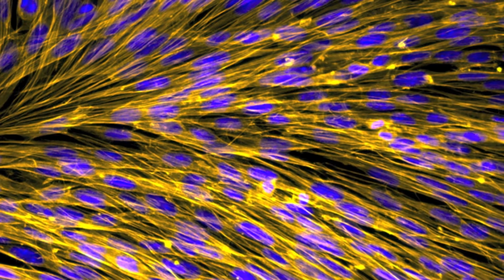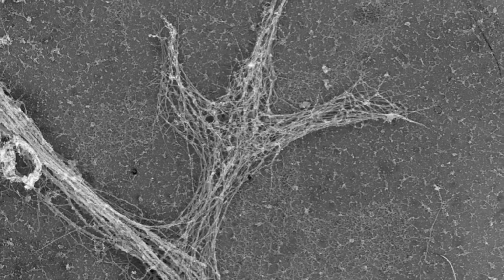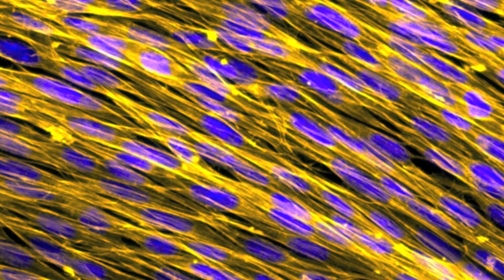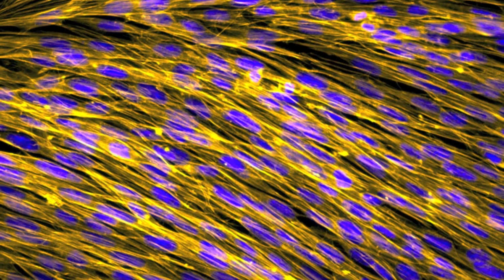What we've stained for in these cells is a protein called actin. And the actin essentially makes up the skeleton of the cell. And you'll see that when you induce contraction, this actin gets remodeled. And in this case, we've stretched the membrane, and you can see that there are large actin filaments that are kind of aligned, and that tells us that the cells can respond to this contractile force. When we take away these cell adhesion molecules, the molecules that surround the cell and transmit these signals, you won't see the actin cytoskeleton get bigger or smaller. You won't see this remodeling event take place.